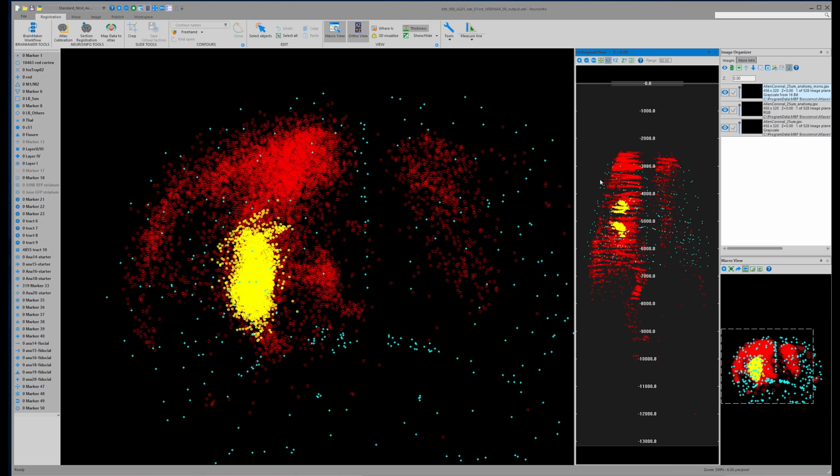Yeah, exactly. So after we've done the linear transform, this top-down view is showing the location of the markers now in the Allen space. If the brains were perfectly orthogonal, these would be straight lines, because the markers for individual sections are in the same plane. However, because of the offsets that we've used, there's some angle. You can see a little bit of an angle from right to left. And if we put this in the other dimension, you'd see the angle from top to bottom.